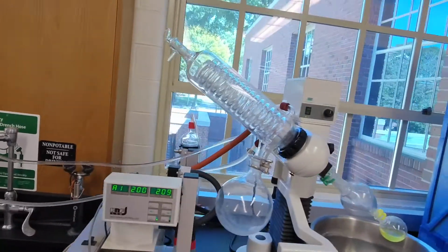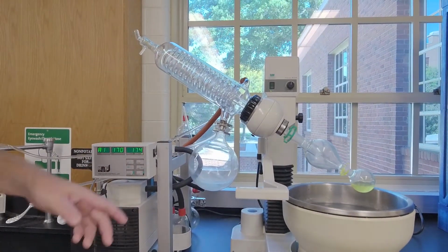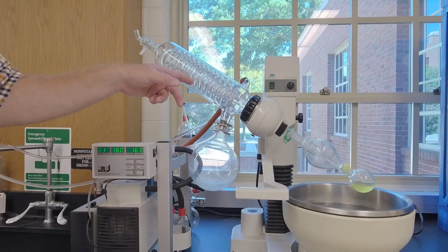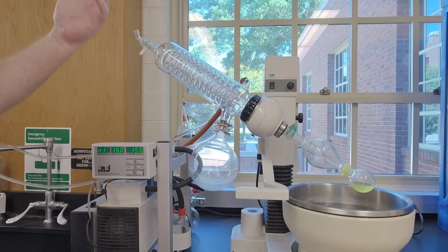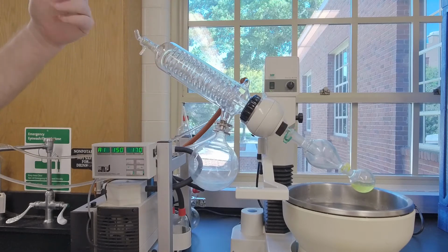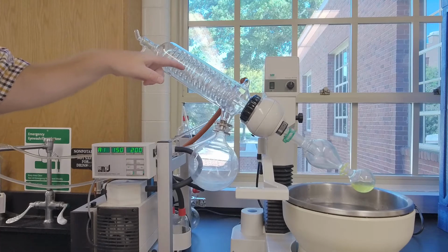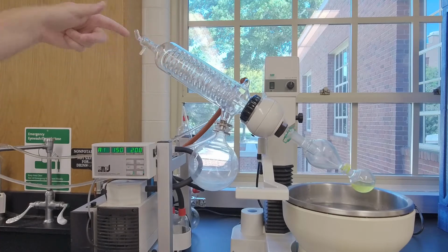So what happens when warm vapor hits cold substance? Well, just think about your car, you come out after a cold night, there's dew on it, right? Maybe ice. So I don't know if you can see it or not. There's starting to be some condensation. We call something like this a condenser.